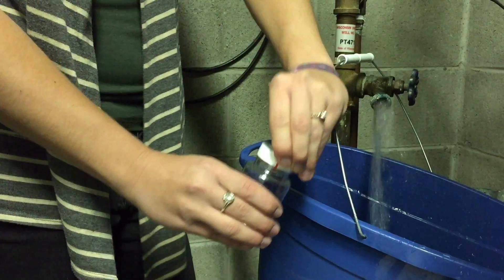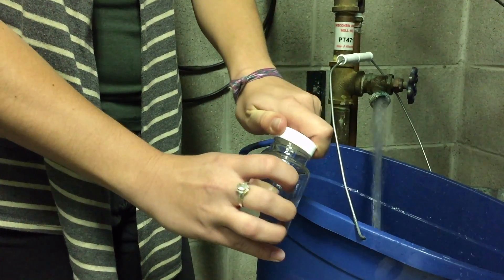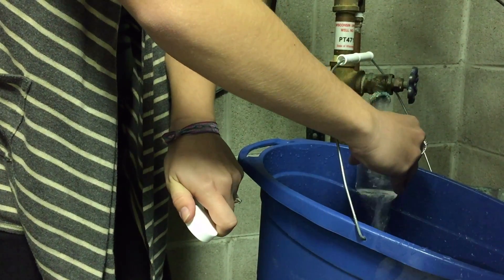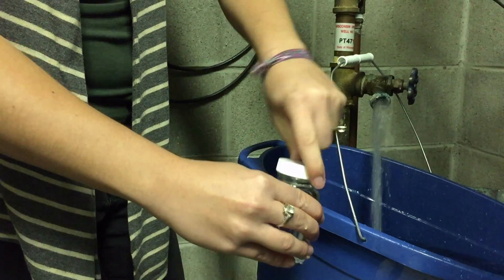Open up a plastic bottle that's been sealed, put that under the spigot under the running water, and fill the bottle completely to the top. Once you do that, put the cap back on, put it on ice, and bring it into the lab the same day that you took it. You can bring it into Waukesha County, which is located at 515 Westmoreland Boulevard.